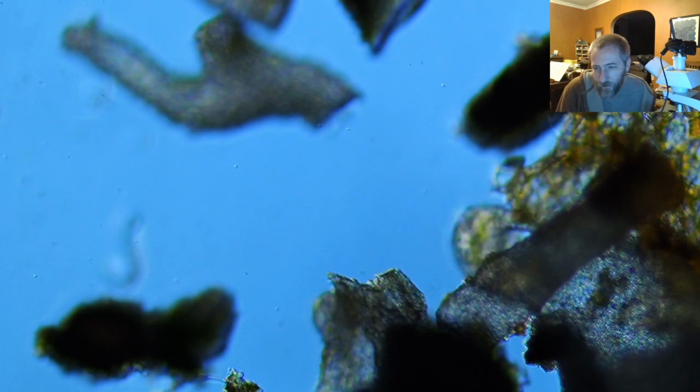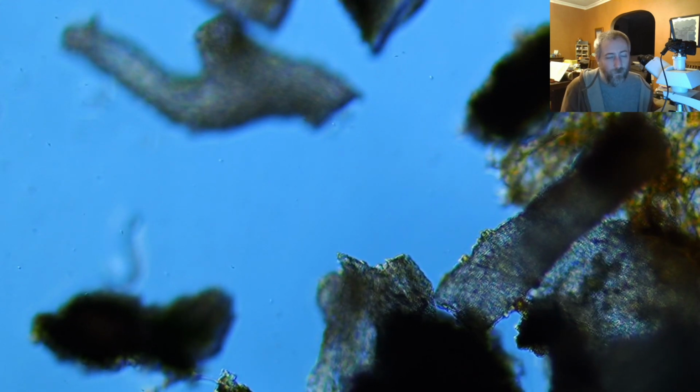You didn't know that there were different species of water bears. In fact, there's something like 1,300 different species of water bears. There's quite a few. And they are all suited to different environmental conditions. You can see there's a little tiny guy right here on this piece of lichen.